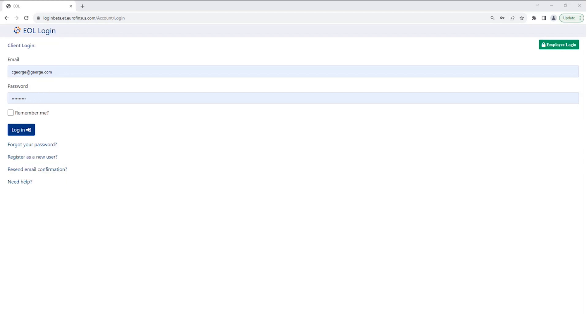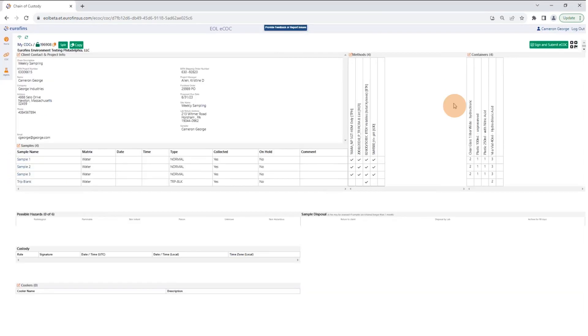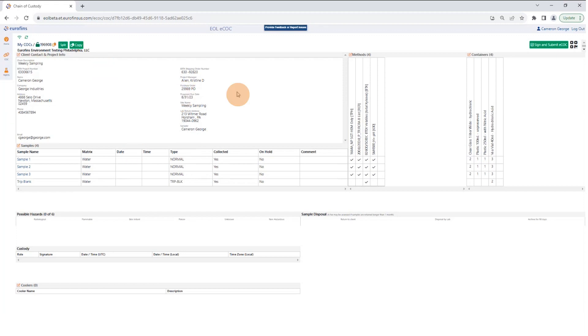Once you log in to eCOC, you will be taken directly to the electronic chain of custody that is associated with the bottle order. Once you open up the electronic chain of custody, you're going to want to review all the sections.